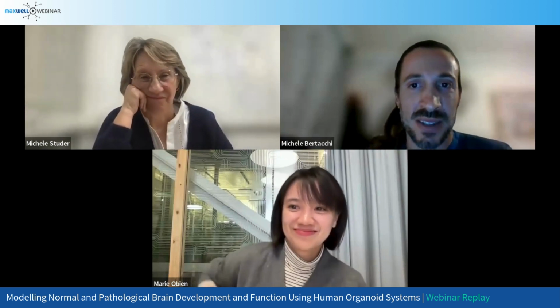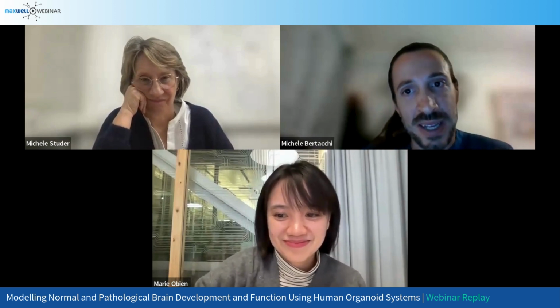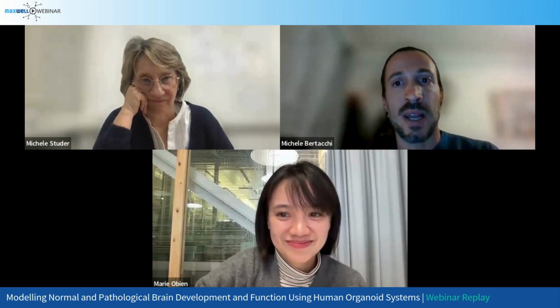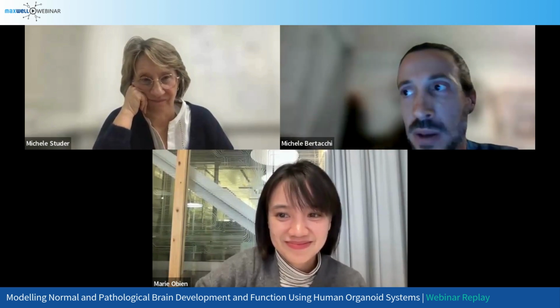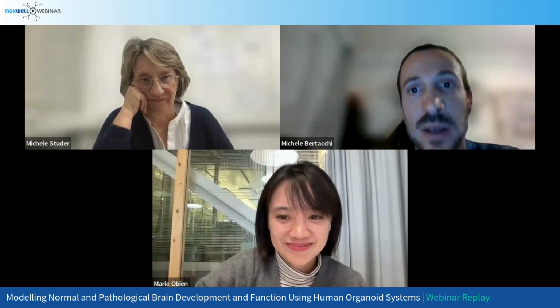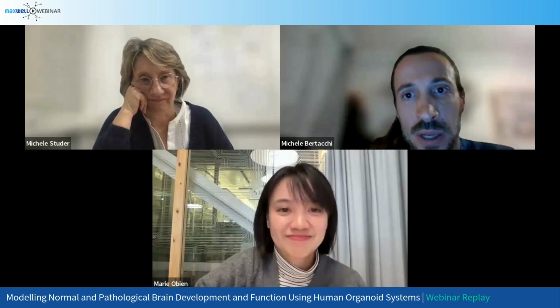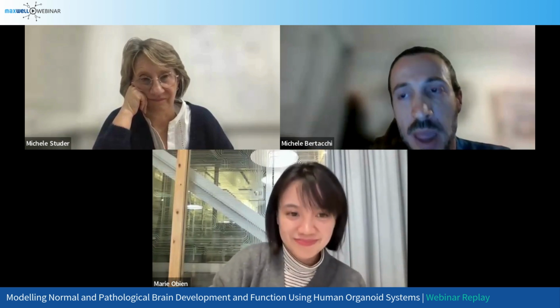Beautiful question. As I mentioned at the end of the presentation, we are really trying to scale up the complexity of the system. You want to have something that is in vitro, simplified, easy to access, but at the same time, you can try to scale up a little bit the complexity of the system. We are adding endothelial cells. We also have astrocytes, but not a lot, and we have to wait for a longer maturation time of the organoids.